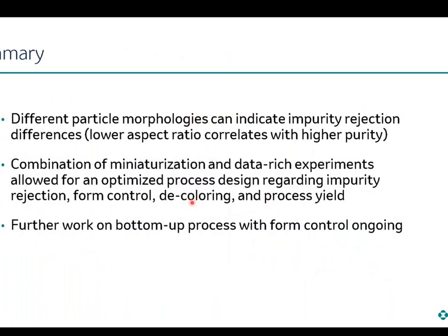With this, I'd like to provide a quick summary. The different particle morphologies, as shown, have in this case highlighted differences in impurity rejection, with lower aspect ratio correlated with higher purity. And the combination of miniaturization and data-rich experimentation allowed for optimized process design regarding impurity rejection, form control, decoloring, and the final process yield. And hopefully the further work on a bottom-up process will still yield some fruit.